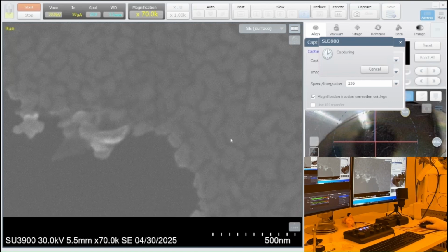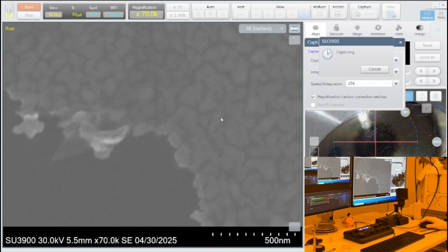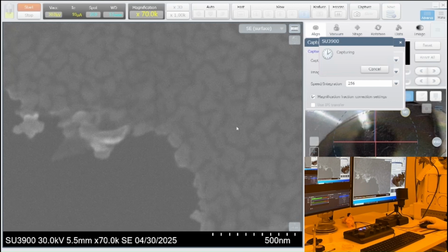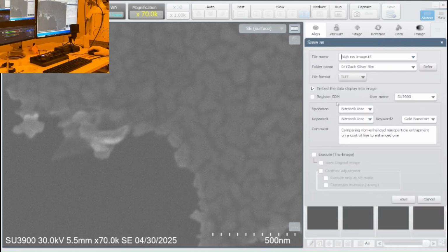So you put the film on and you want to look in here to see. Is this good enough to get that information? I think so. Yeah, that's good. There's also software you can put this into that will analyze it for you. It'll tell you the surface area. I think Bob, when he comes to do the advanced training, could show you how.